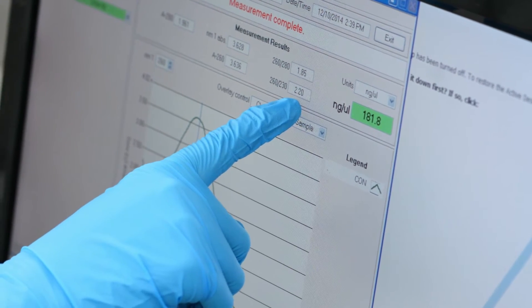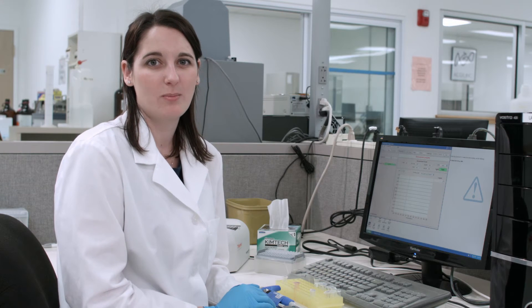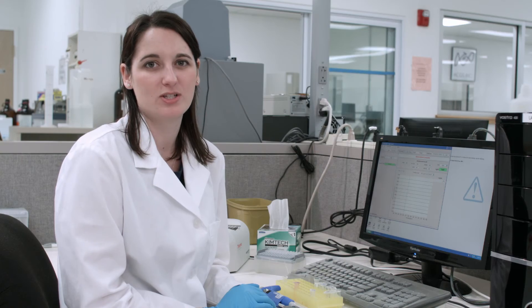If the ratio is much lower, then this means the samples have salt contamination and this will lead to noisy data. We therefore recommend re-purifying the samples before submission.